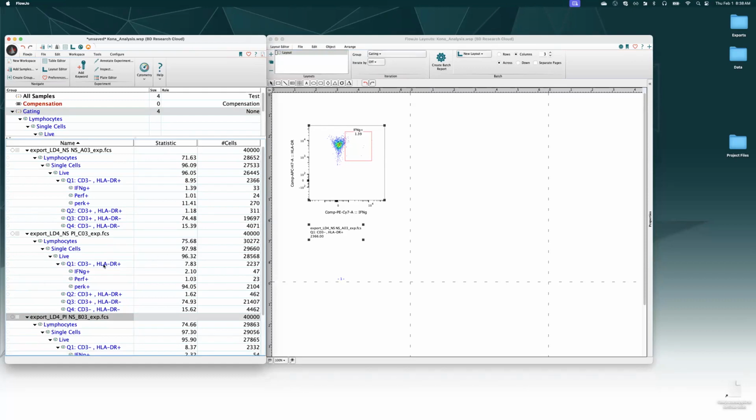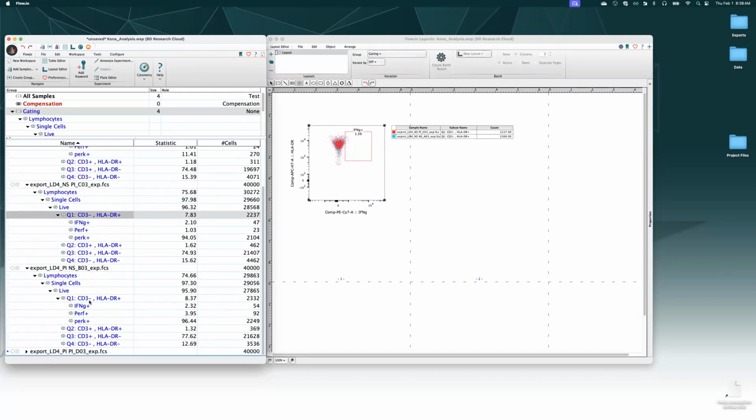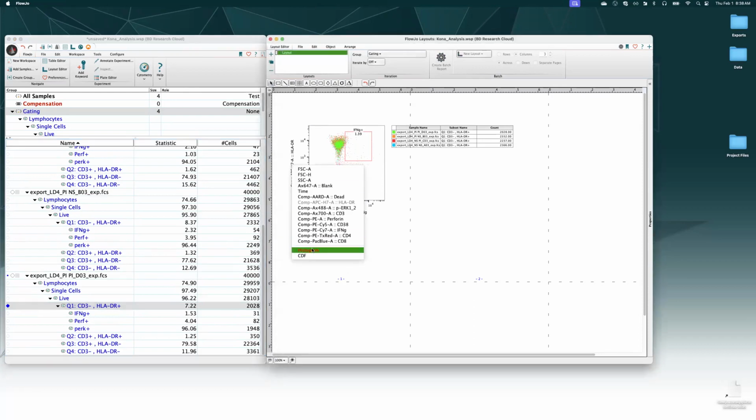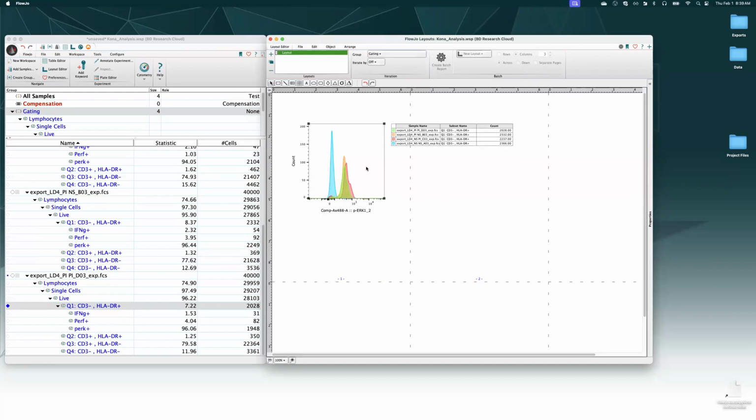So when you're creating a template, you wanna make overlays, but not generate any batches yet. So you'll set them up pre-batch. There you go.